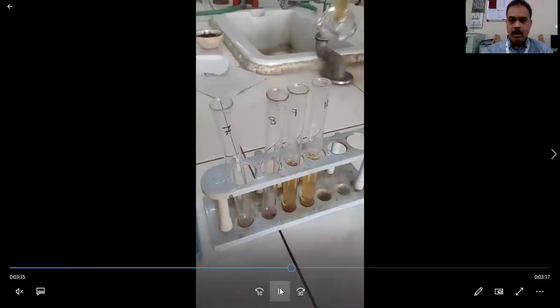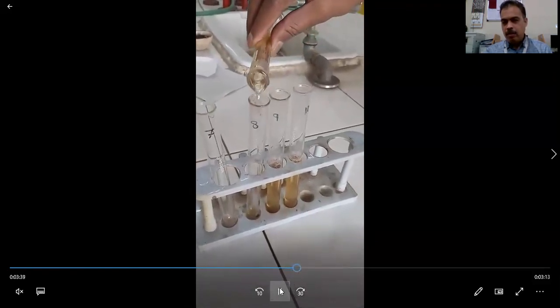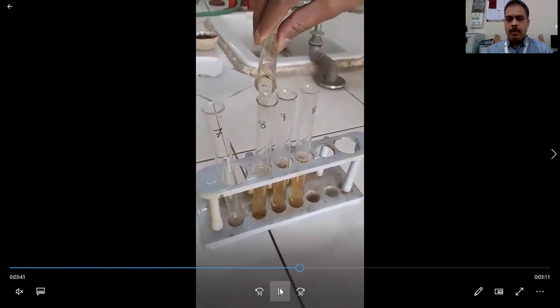We'll put this into the 9th test tube. Now for the 8th test tube, we'll take 8 ml of filtrate and make the volume 10 ml by adding water. Then for 7, we'll take 7 ml of filtrate and 3 ml of water.